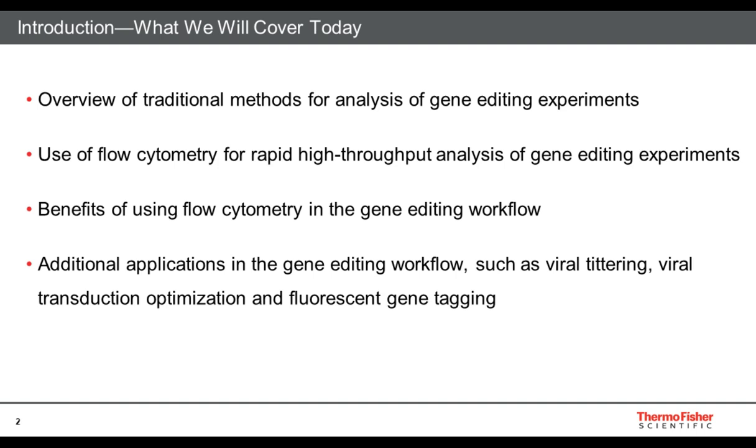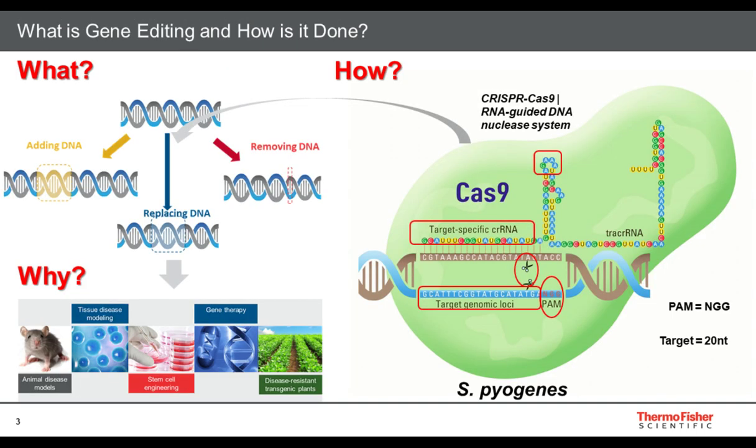We'll also discuss some of the unique benefits of using flow cytometry in the gene editing and cell engineering workflow, and then also highlight and touch on some of the additional applications in the genome editing workflow, such as viral titering, viral transduction optimization, and fluorescent gene tagging.